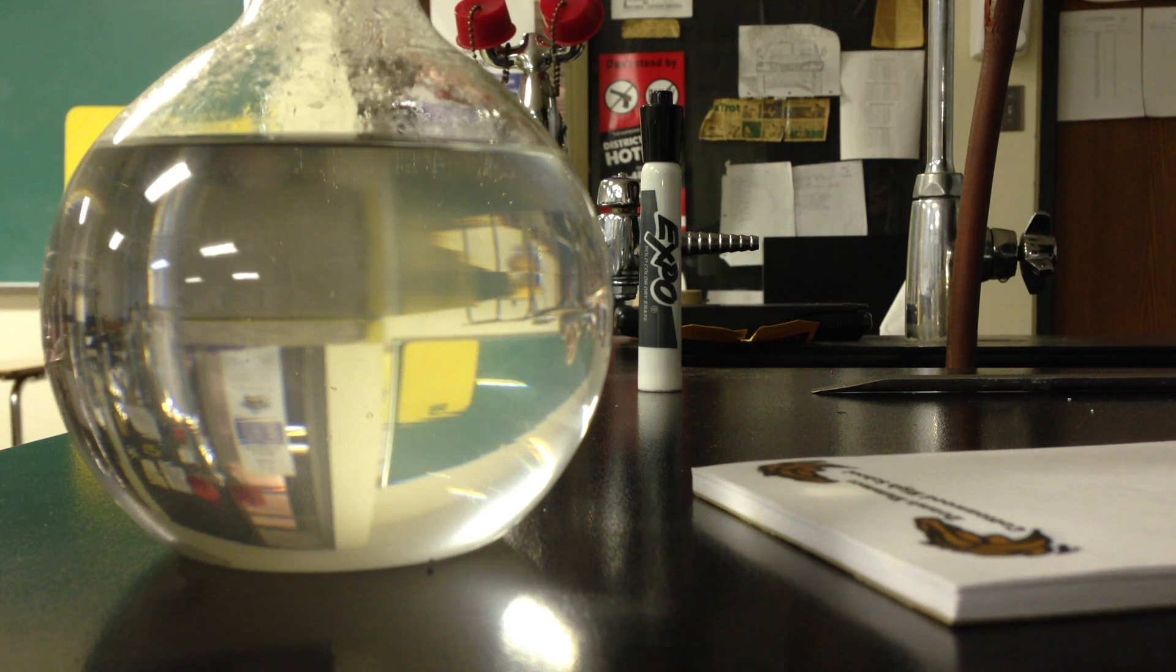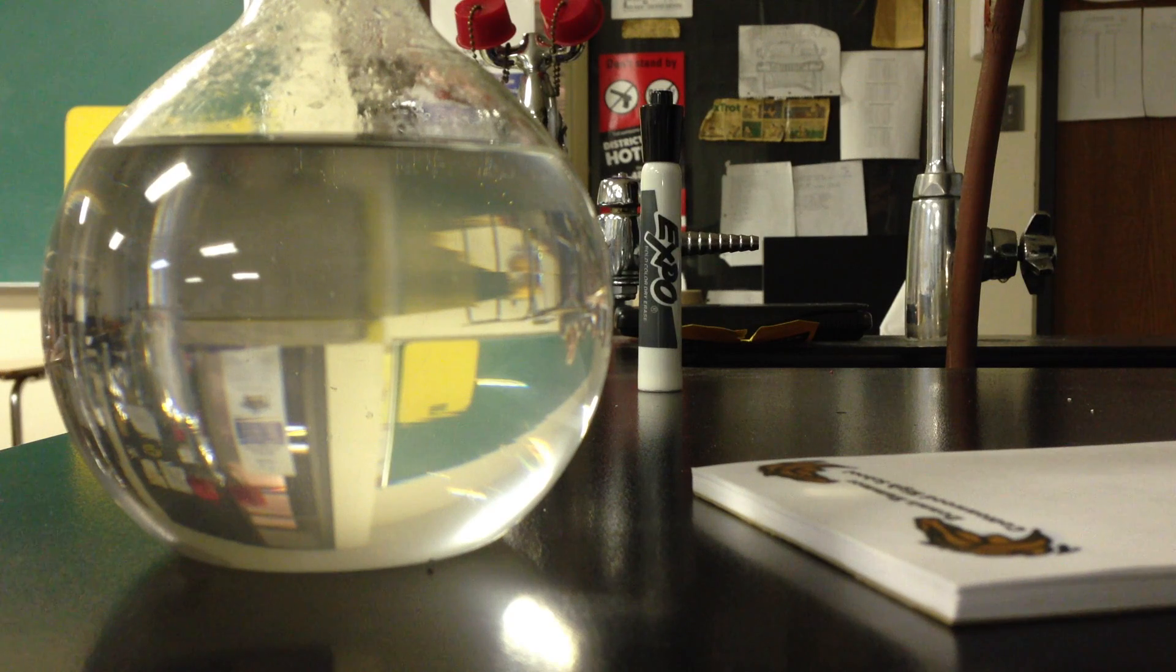So this is a supersaturated solution of sodium acetate. I made it this morning for you guys. What I did is I took about 600 or 700 grams of sodium acetate and I put it in the bottom of this flask and I added 25 milliliters of water and it wouldn't dissolve.